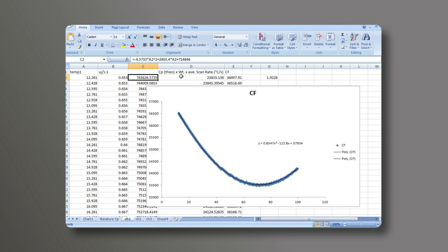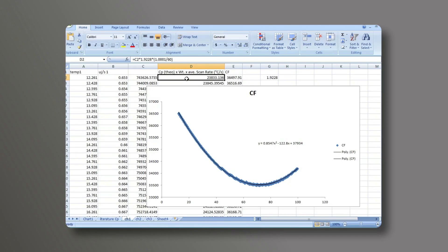In the next column over, we take that theoretical heat capacity in column C and then multiply it by the weight of the sample in grams and the average scan rate. In this case, we need to make a conversion again on the units. Instead of one C per minute, it needs to be in seconds.